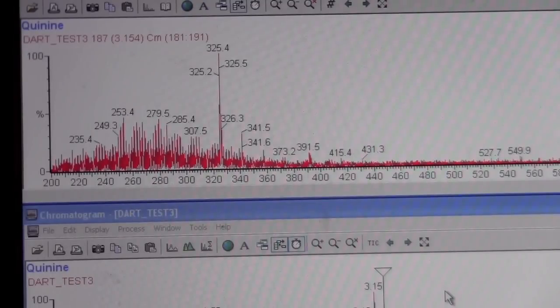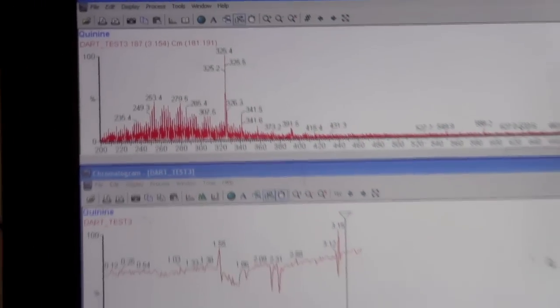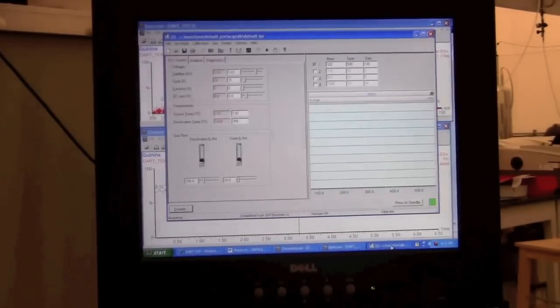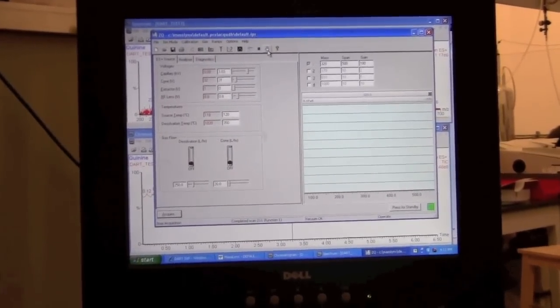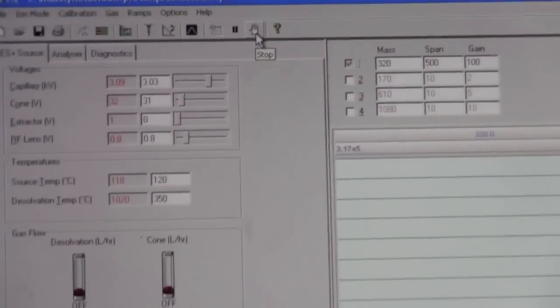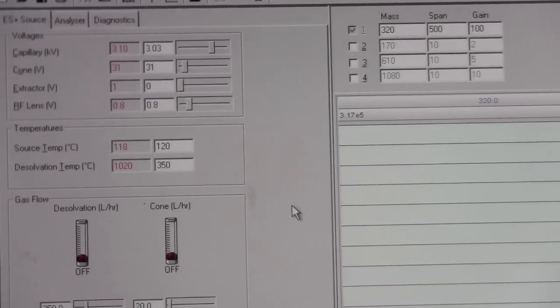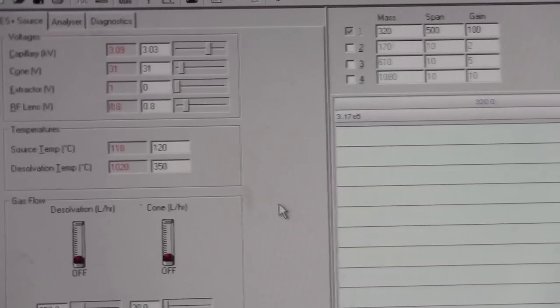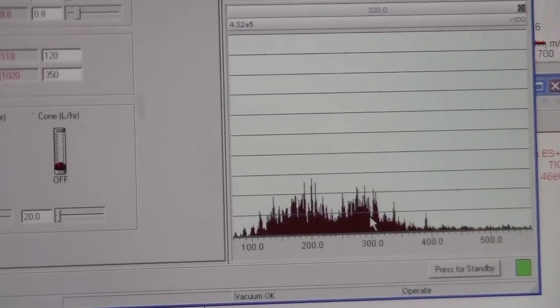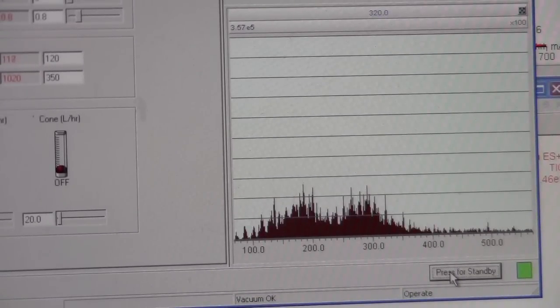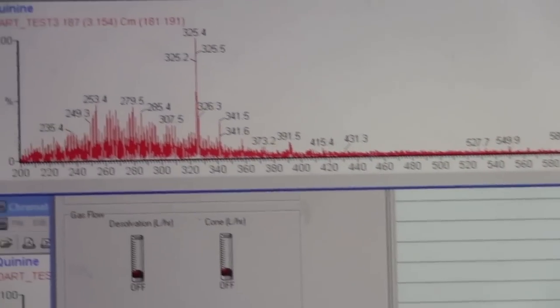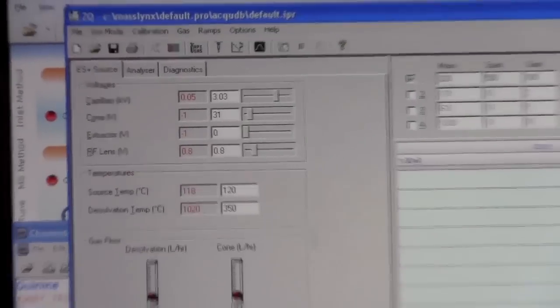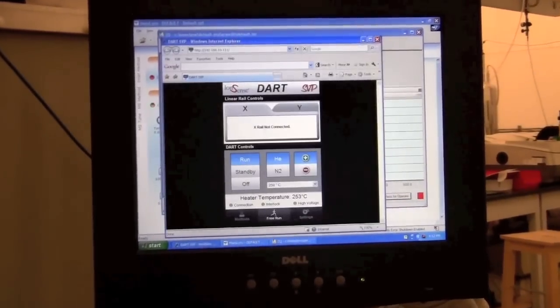When you're finished what you should do is go back to the tune page. If you're done taking data you can click on the hand to stop acquisition. Yes you really want to stop acquisition. It should put it back where it's showing ions here. That's normal. If you want you can put it on standby, it's not necessary but it's a good idea. You can close the spectrum and the chromatogram pages and then you can go back to the dart source.